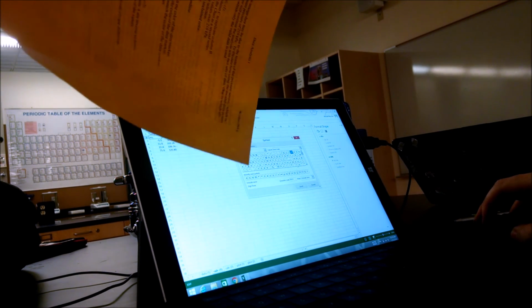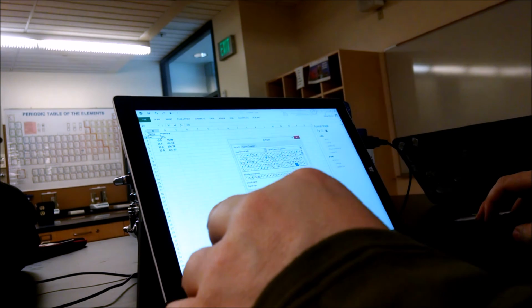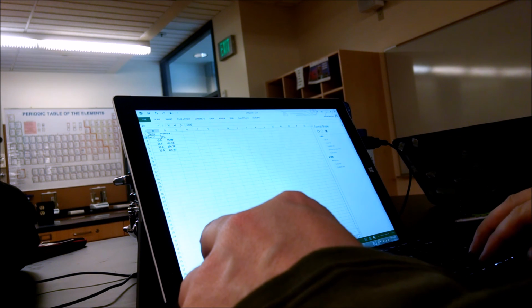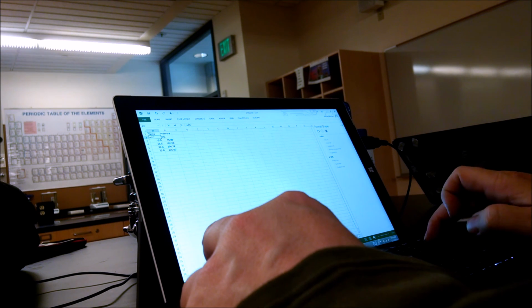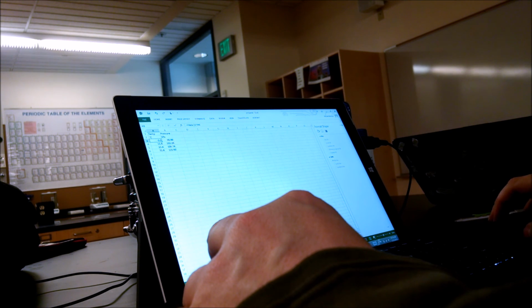I think it was right there. Yeah, there we go. There's a bunch of symbols that look like that, and then close. Degrees Celsius, and then we got to get rid of those milliliters. Why are they there? Okay. All right, so there's that.